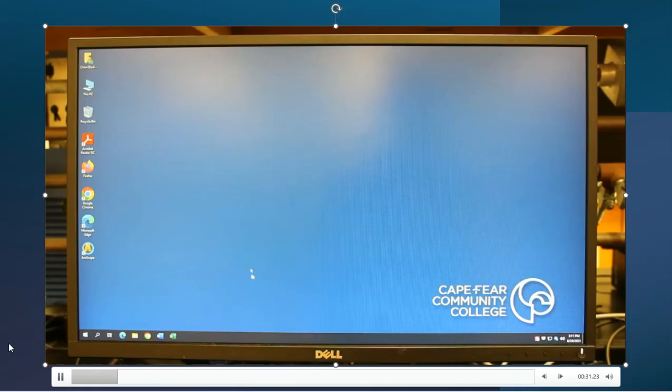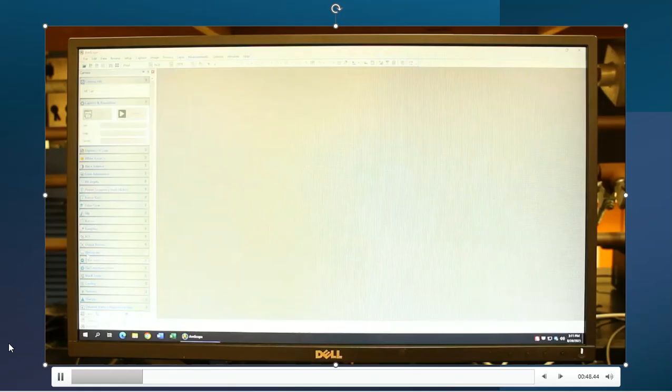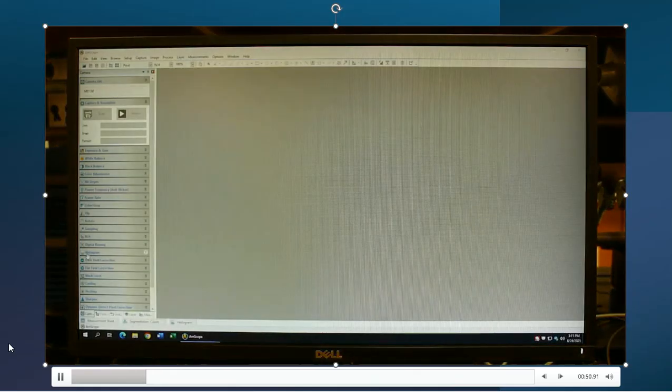All right, once the microscope is on, on the computer screen I'm going to go to this icon on the desktop, and it's called AMScope, A-M-S-C-O-P-E. I'm going to double click the AMScope software, and this is going to start connecting the software to the microscope. And I just really see a blank screen. I mean, that's it, right? Nothing on here at all for me to do. I get no visuals, no video, no pictures. Nothing is coming through the USB camera at this moment. That's because I really haven't connected it fully.